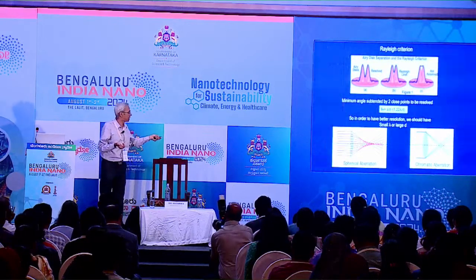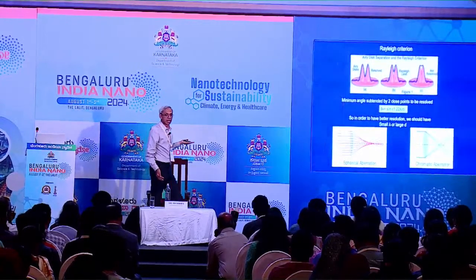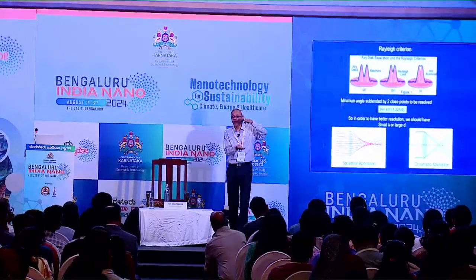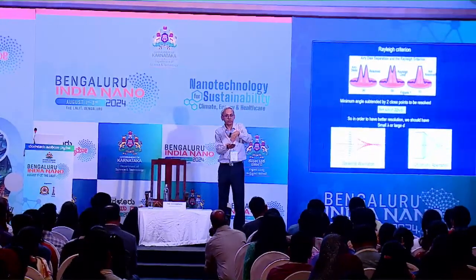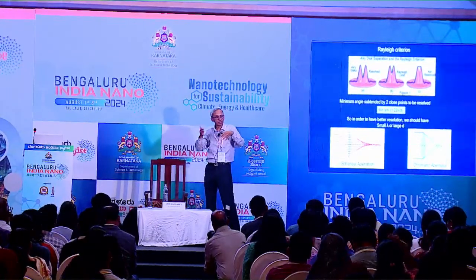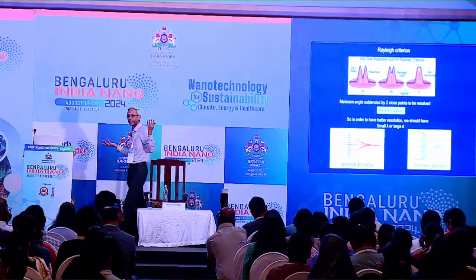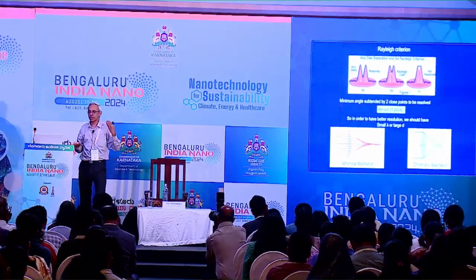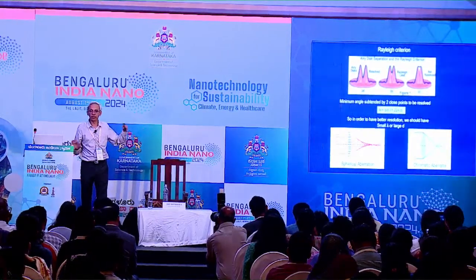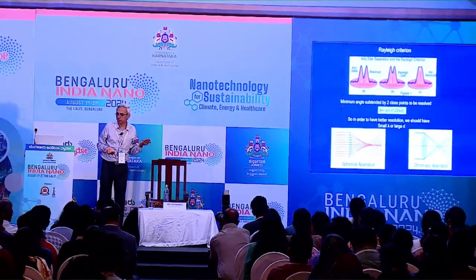But what happens when you make d larger? For any lens, the other possible problem is that as you make d larger and larger, rays that are coming further away from the optic axis are not going to focus at the same point. This is called spherical aberration. Because the lenses have spherical surfaces, they don't get focused at the same point. So by making d larger, we are not gaining anything. What we are gaining over the diffraction limitation, we are losing to spherical aberration. Therefore, increasing d is not a real practical solution for improving the resolution.